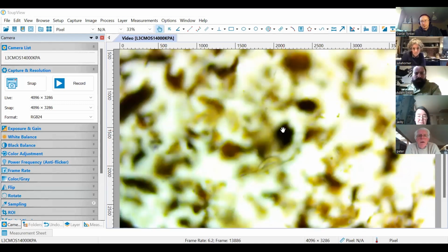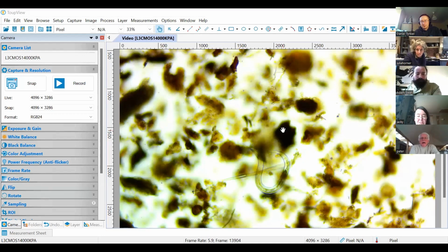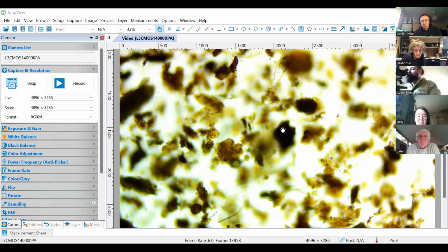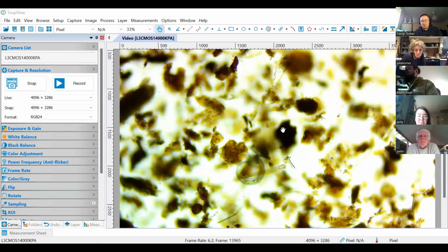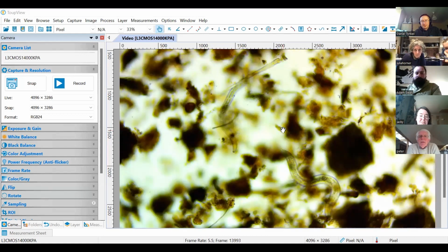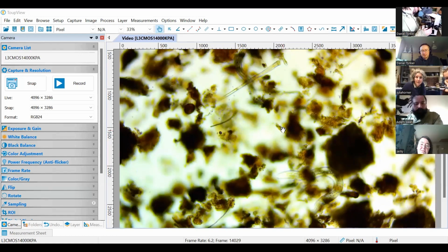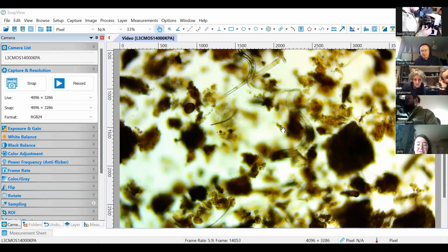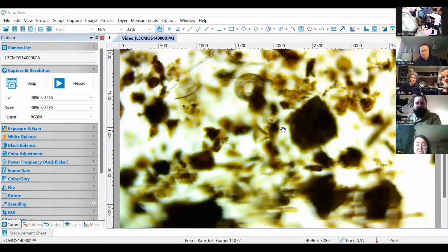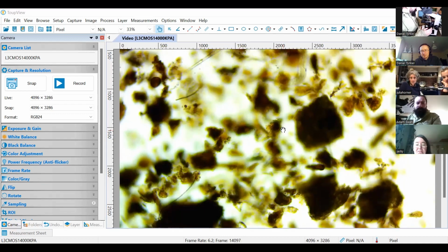So now this is in our product. This is the goop. It's pretty easy to find a nematode in here. It's actually 2. So this is still at 100 times total magnification. And to identify them, we drop down to 400 times.